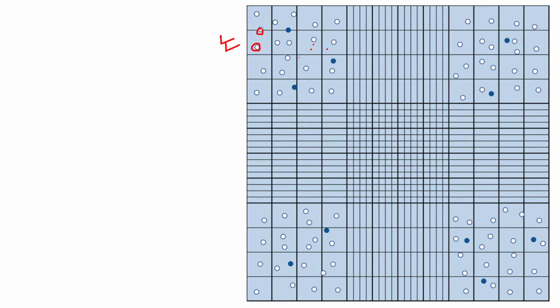So how will you get this under the microscope? For that you have to make a mixture of cells. Suppose there is a cell suspension of volume 5 ml.